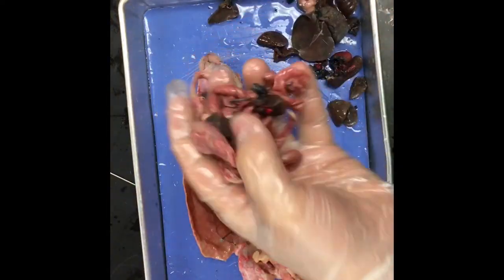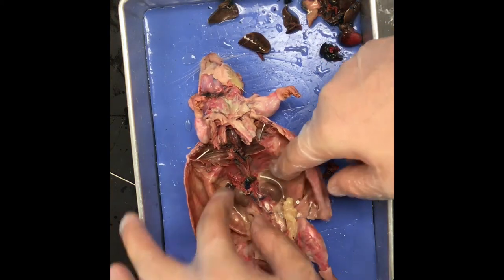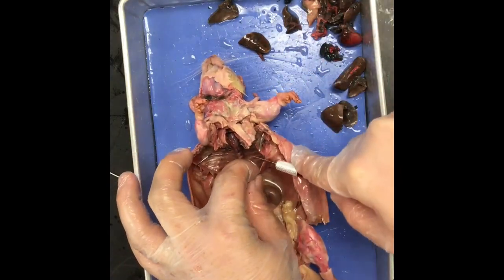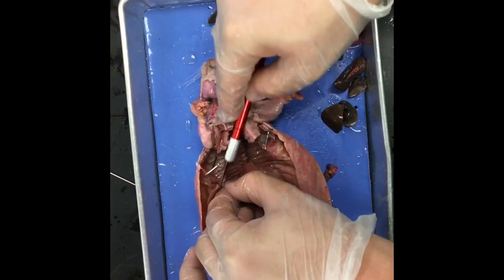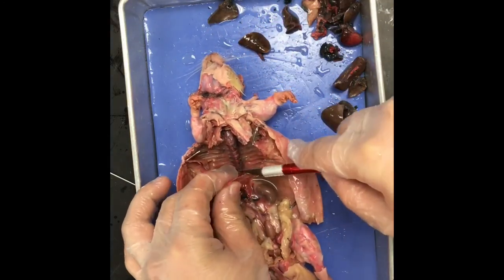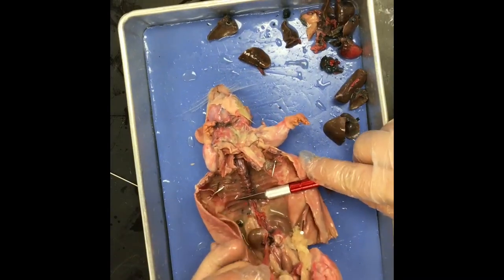That's removed. Where's the biggest large intestine? Large intestine was pointed out at the bottom there. Yes. All right, so now that that has been removed, you also have, what's this in the back? Kidneys. You won't be able to check these for stones, really, because they can be very small in humans. They'll be microscopic in these guys.